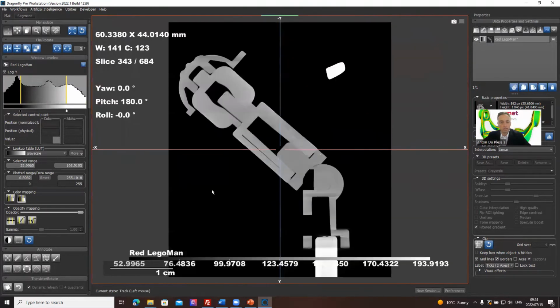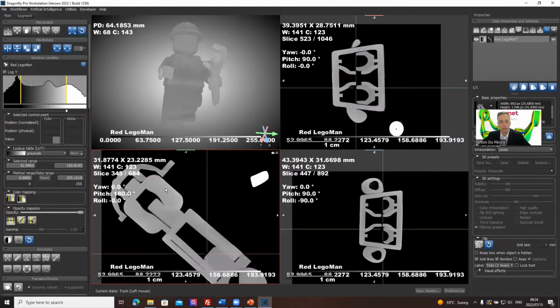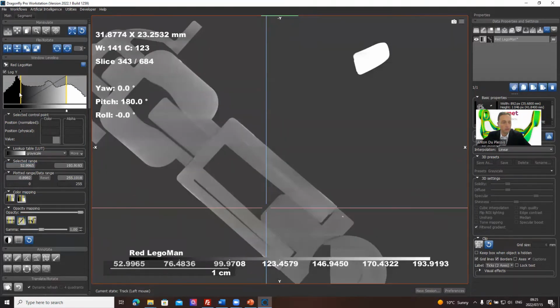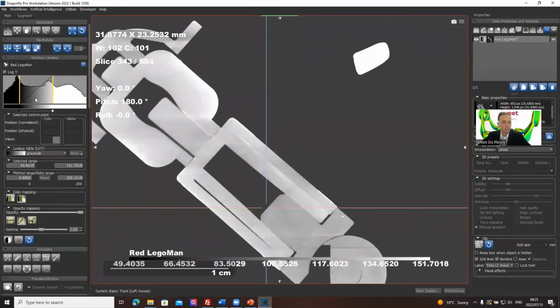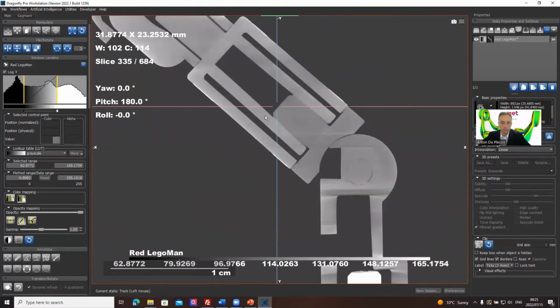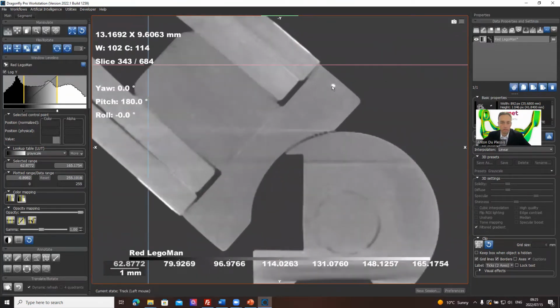Let's talk about optimizing the contrast in the 2D window. By the way, I double clicked in the 2D window to maximize it. What we can do here, it's got a separate thing. So rather than the default, we can change to an opacity gradient. And what we can do is drag it around to optimize the contrast. So let's see. There we can see something interesting, which we might have missed if the contrast was not good enough. There's an inclusion there. So that's it for now.